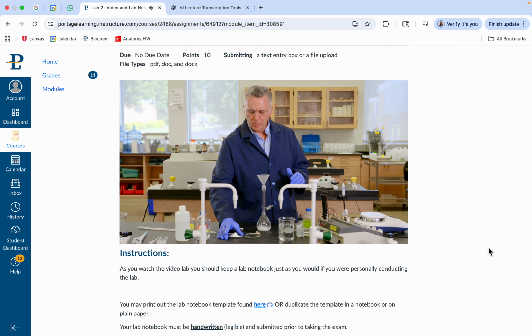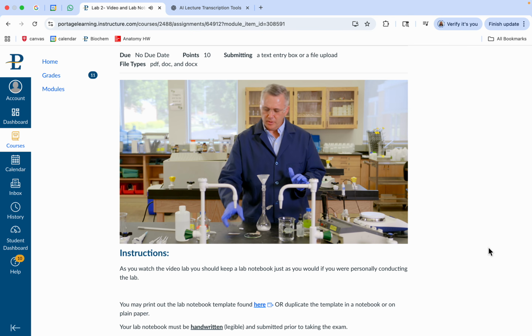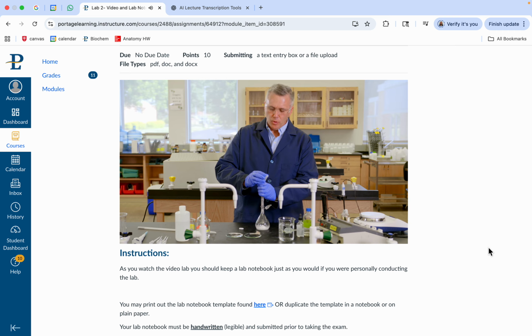All right, so that's the sodium phosphate monobasic. Here's the dibasic. So we're going to put that in, and again, we use the same powder funnel just because they're all going into the same vessel. All right, so that's our dibasic. I need to just get it to go in just a little bit more.